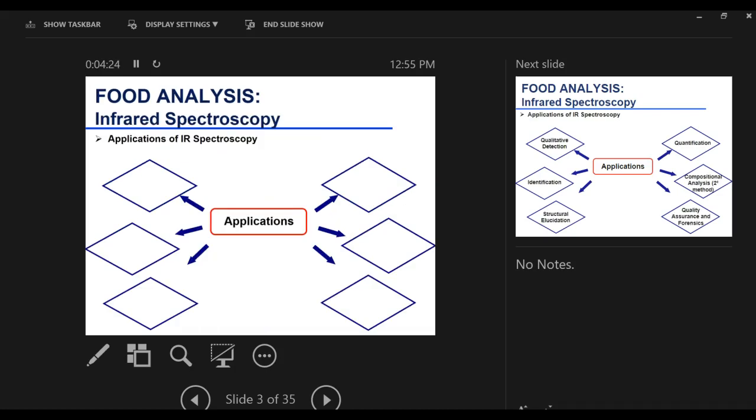So what can you come up with in terms of applications? Things I already said. Yes, Laura? Forensics. So if we're looking at identifying a foreign matter, and I have an example later on, looking at presence of melamine in infant foods or pet foods. So you can look at the IR spectra of the infant formula with and without melamine and try to determine if melamine is present. Okay, what else? Tammy?